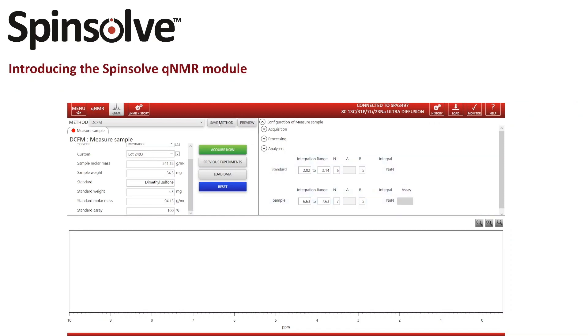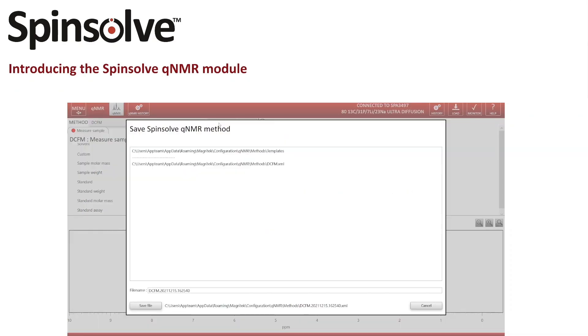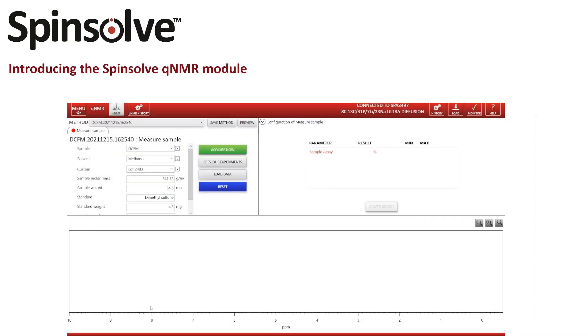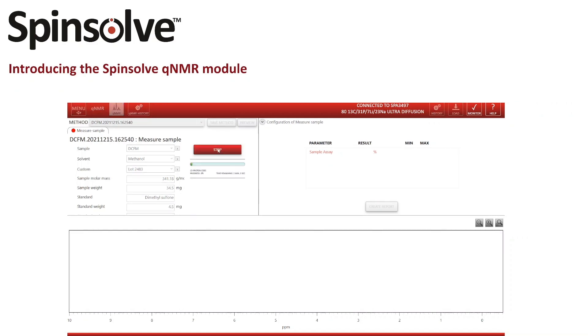Now that I've finished the method, I save it again. Each time I save the method, the software adds a new timestamp to the method name which allows easy following of all changes I did to the method. Now I can start my experiment by clicking on the acquire now button.